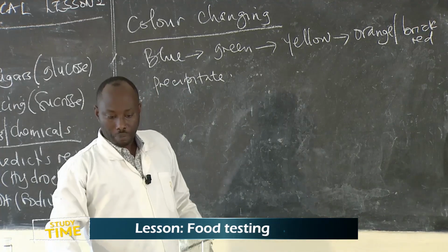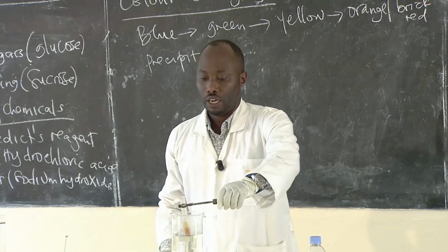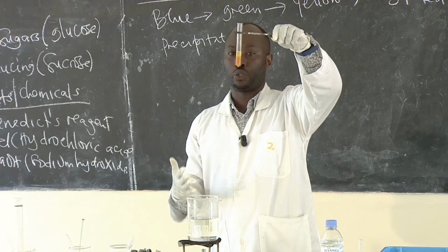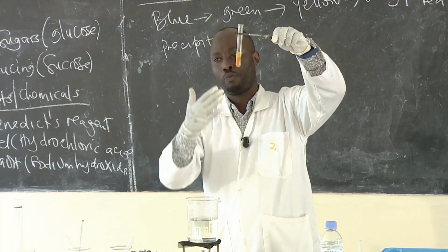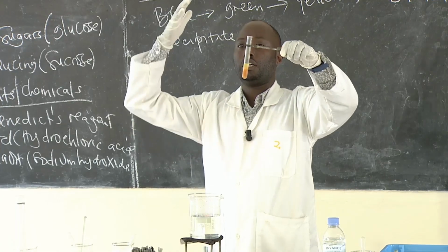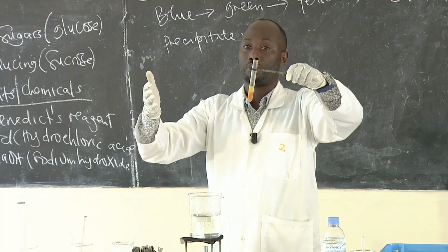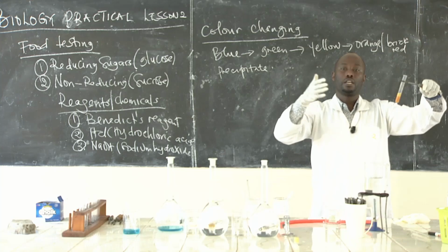So I'm going to observe the changes that have happened. Of course, everybody can make an observation and a conclusion. What color do we observe from here? It has changed from blue to green, then from green to yellow, then finally to orange. Sometimes you can also observe the brick red.